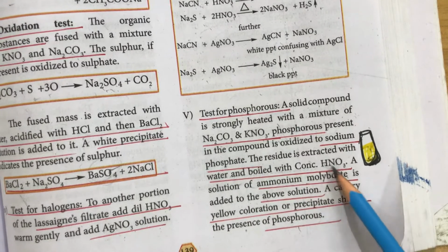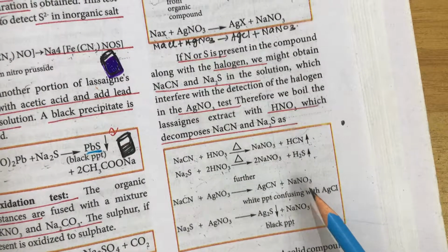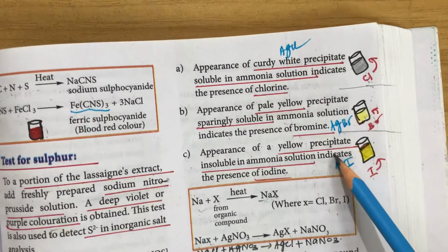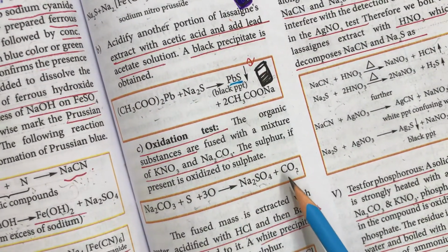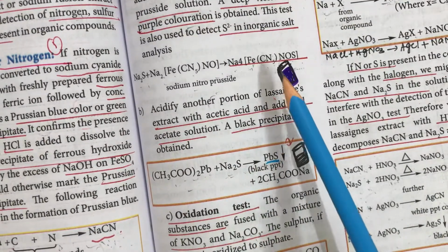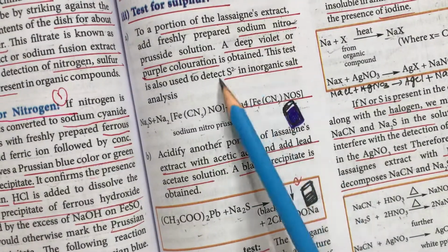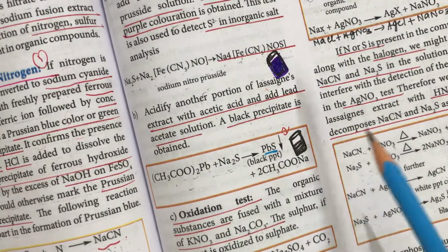So, to recap: the test for phosphorus; the elimination of nitrogen and sulfur during the analysis of halogen; the Lassaigne's test for identifying halogen; the oxidation test for identifying sulfur, giving a white precipitate of barium sulphate; and the tests for sulfur, sodium nitroprusside violet coloration and acetic acid with lead acetate giving a black color.